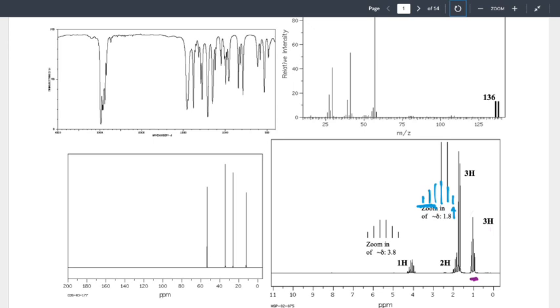So what I would interpret here is 5 plus question mark. Depending on how confident I was in that 5, I might even put an X through the question mark, like, nah, I think I like the 5. I'm going to stick with that 5. But the reason I want to put that question mark is what happens when I try to put together all the pieces. If it doesn't fit, I did something wrong. I now have a very good place that I could start looking for what I did wrong, because I don't trust my analysis there. You are absolutely okay to say, I don't trust myself. Note it. That gives you a way to cycle back and check your work.